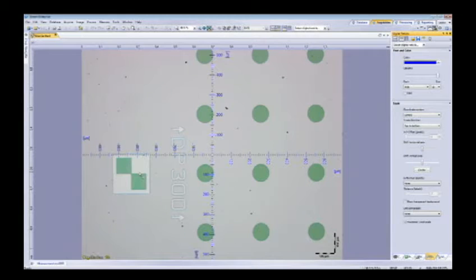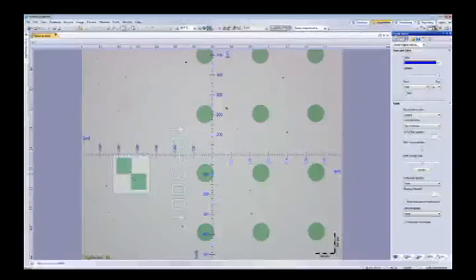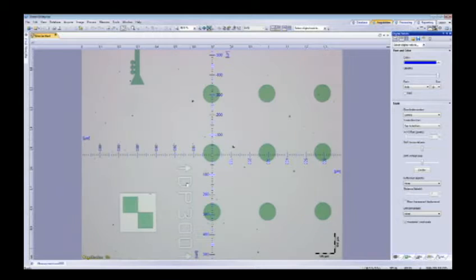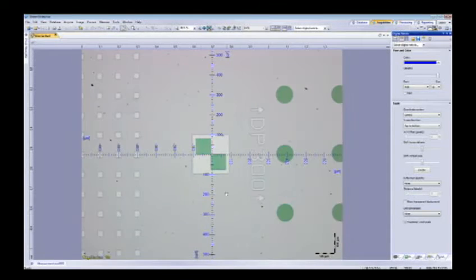We also have a new feature, with a motorized stage like we have on here, the ability to click to center. All I have to do is control and click on a point, and it'll move that directly to center for me. So if we were quickly wanting to measure this box here, we could just put it in between the reticles, touch it up a little bit. We know it's about 200 microns width. This is a way for them not to have to take pictures and manually measure it, just quicker. Drive to the points, move it in between the reticle here, and get a measurement.